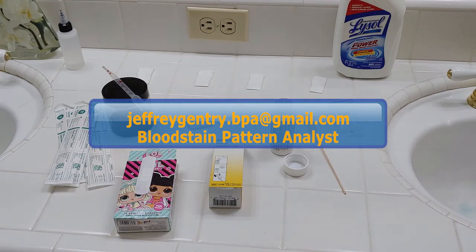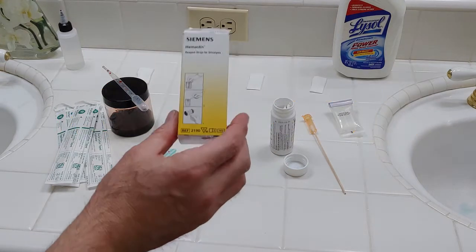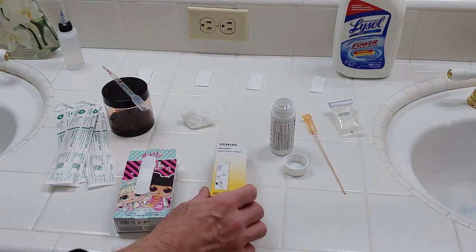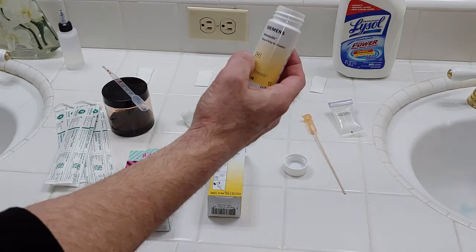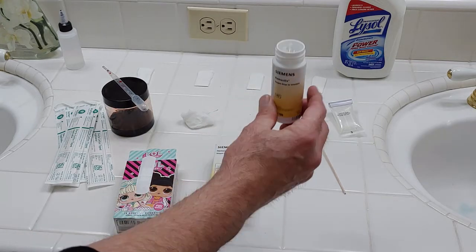Hi, this is Jeff Gentry, BPA, Bloodstain Pattern Analyst. I am here to demonstrate the use of Hemastix for presumptive bloodstain testing. Hemastix is a test strip reagent usually used for urinalysis. Some agencies, like the one I work for, like to use Hemastix for presumptive blood testing.